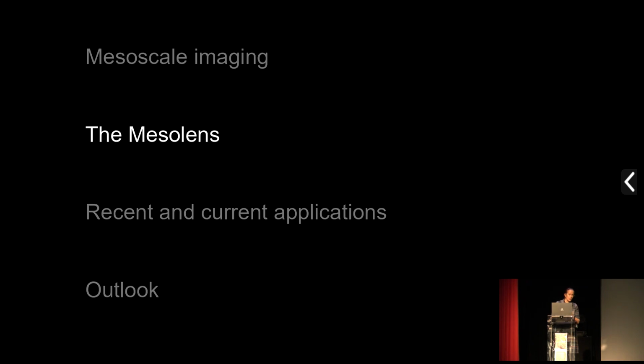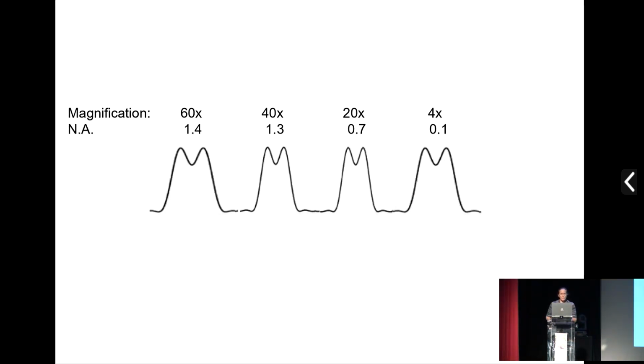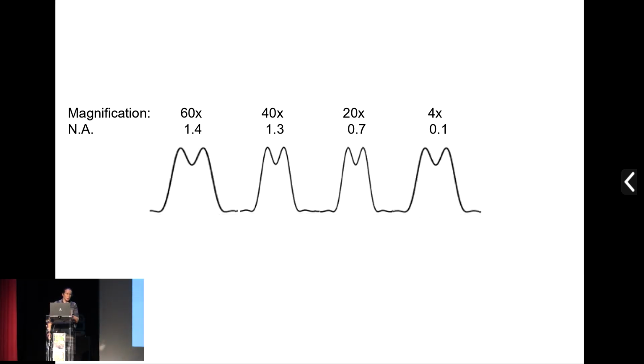Our approach to this has been quite different because most of the technologies that are out there for mesoscale imaging are based on multi-photon, mainly 2-photon excitation of fluorescence. But what we recognised was that there was still a need for going back to single photon and thinking a bit more widely about the problem. And we approached it as optical physicists do from an engineering perspective. So we returned to what the light microscope objective lens can normally do for you.